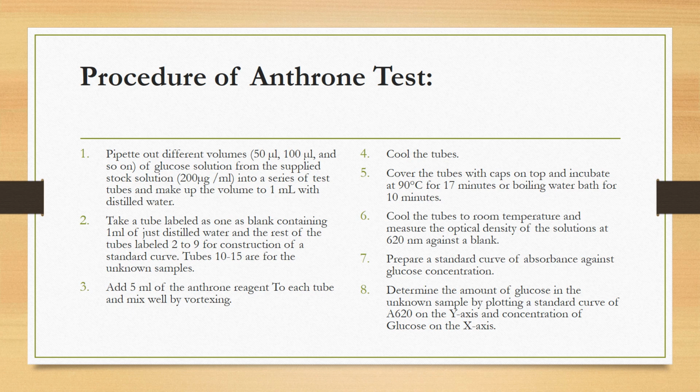It's just distilled water, so we label this tube as blank. The rest of the tubes are labeled 2 to 9 for the concentrations of a standard curve.